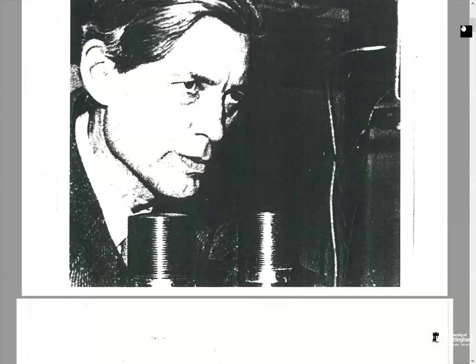Really? What's this? Whiteboard. Okay, so the 11S soybean globulin, S stands for... What's the unit of sedimentation? S. The Svedberg unit. So who's this? Svedberg, yes. Okay, this is Theodor Svedberg.